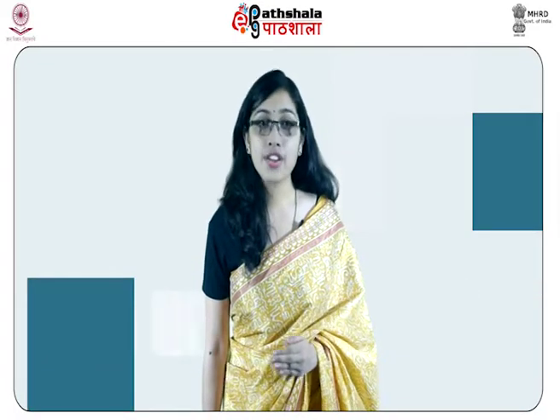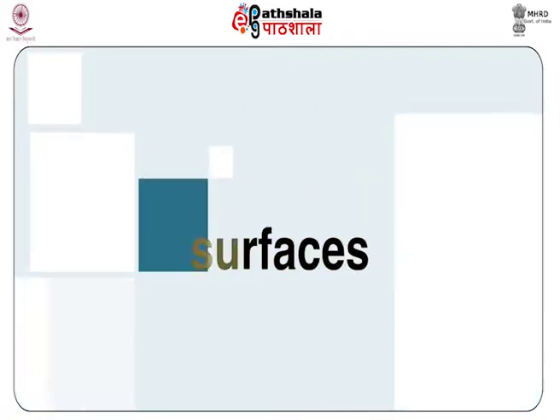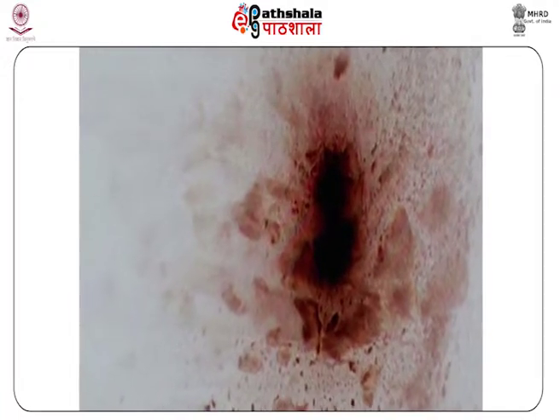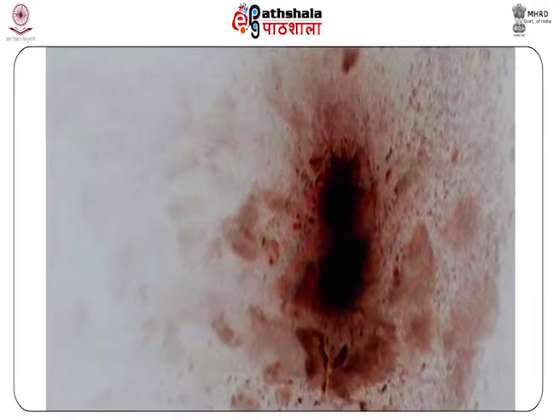On the absorbent surfaces. The absorbent surfaces absorb the serum. Therefore, for correct sampling, stained and unstained materials are separately collected.